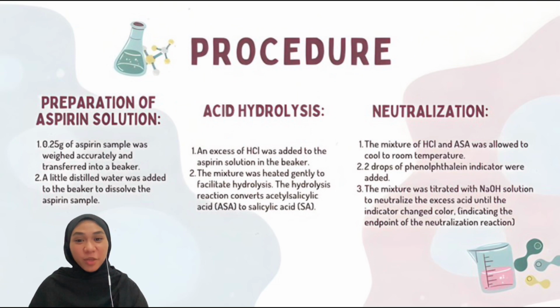Next, for the procedure, we will have 4 parts, the first one is preparation of aspirin solution. First, 0.25 gram of aspirin sample was weighed accurately and was transferred into a beaker. After that, a little distilled water was added to the beaker to dissolve the aspirin sample.